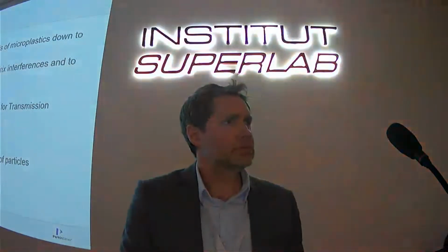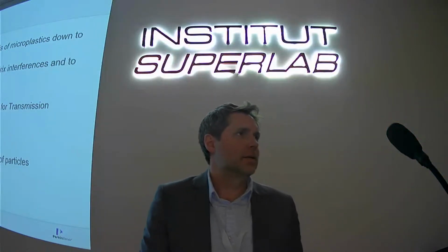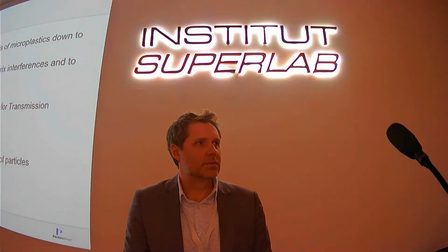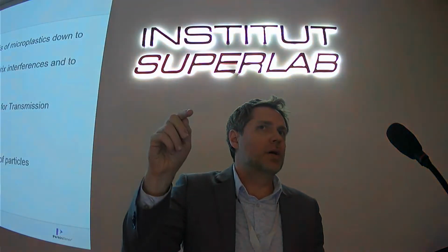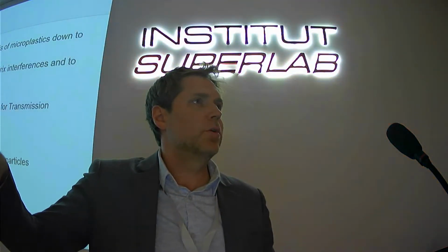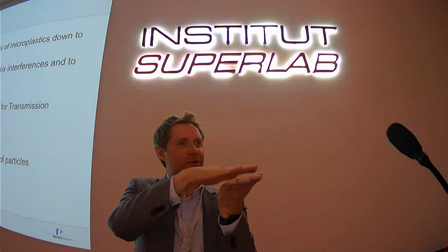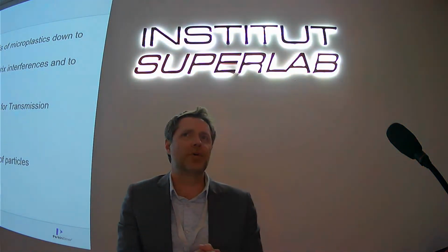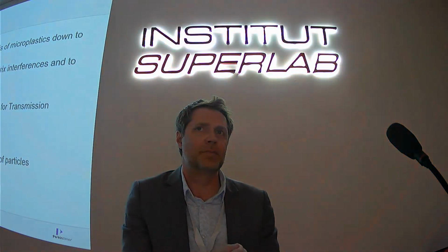Just an additional question: how do you do the background subtraction, especially in microplastics? Do you propose to your customers to have these blanks, the procedure blanks, this type of thing? So if you didn't go downstairs and see Roberto's demonstration, you saw he was looking in between on the filter. He was using that as a background to subtract. That's for filters. That's what people typically do, and that's what we recommend, is use the filter as the background.